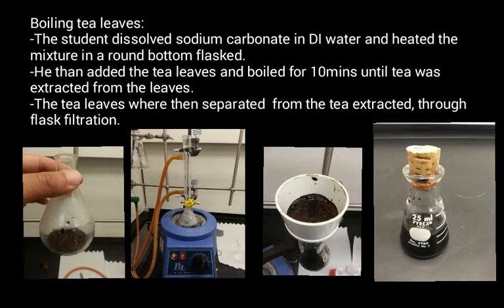One of the biggest unavoidable errors was flask filtration. The boiled tea extract would get the funnel clogged and we would have to use a different filter paper, which in theory did contain caffeine in it. The tea leaves were also still very moist, which meant that we still had caffeine inside the tea leaves. This made it impossible to obtain the full amount of caffeine from these tea leaves.